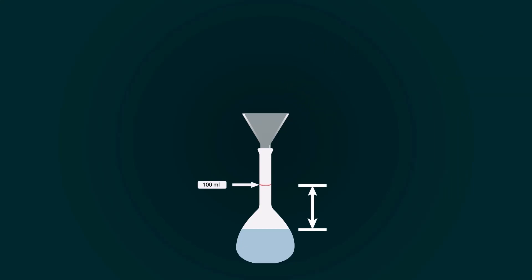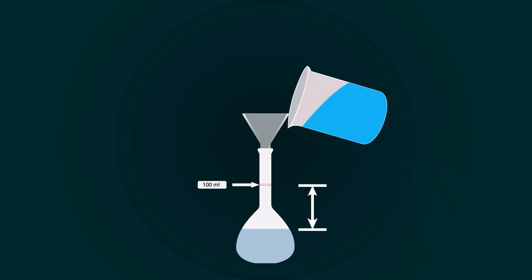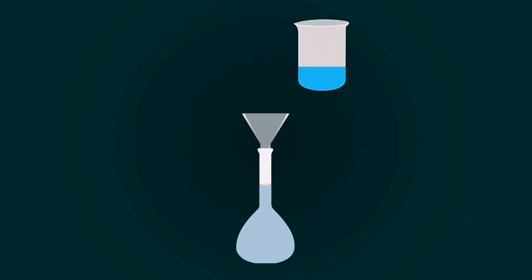For that, you have to add more distilled water into it. So take some distilled water into an empty beaker and pour it into the volumetric flask to fill it up to the 100 ml mark.